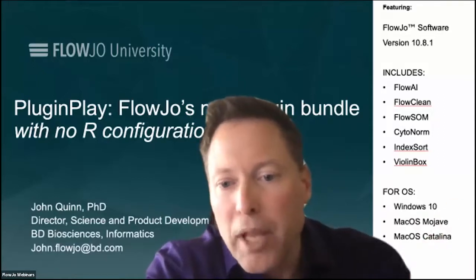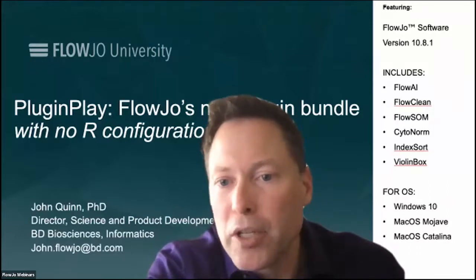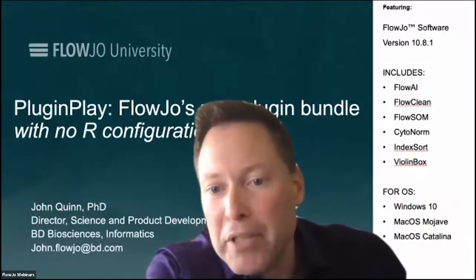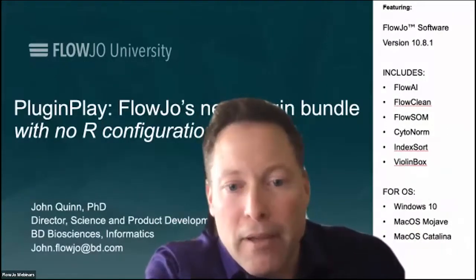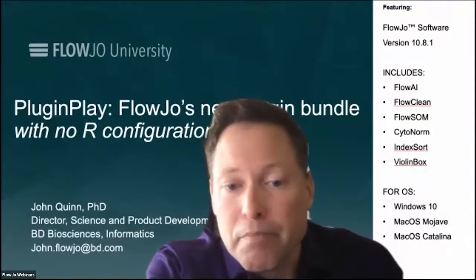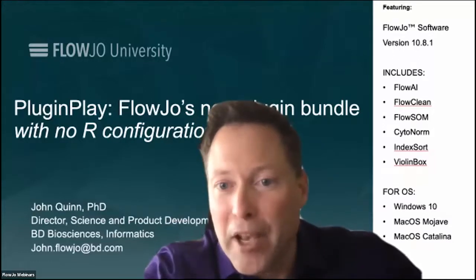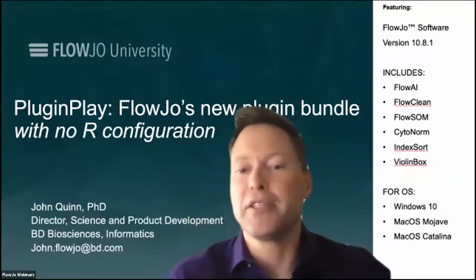The Plug and Play bundle is a set of the 6 most common, most used plugins listed over here that require R. They're bundled together with R and everything needed to set them up, so that the only thing needed for the setup is just to download the bundle and drop it in place. I hope this is the first of many updates to the bundles as we include more and more plugins that auto install themselves, set this up, and work easily.